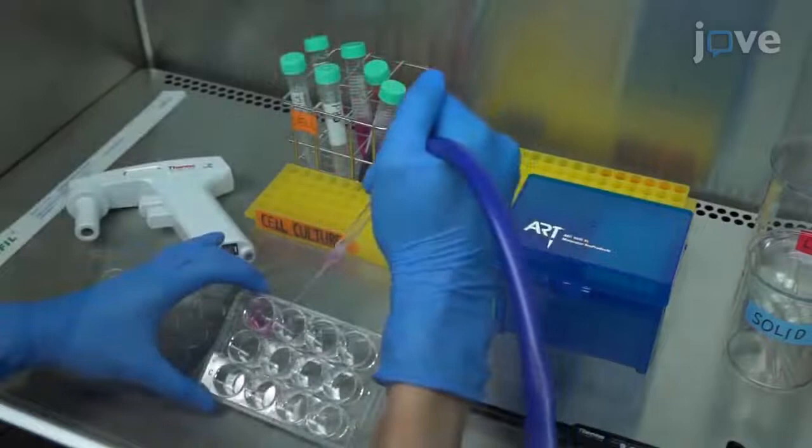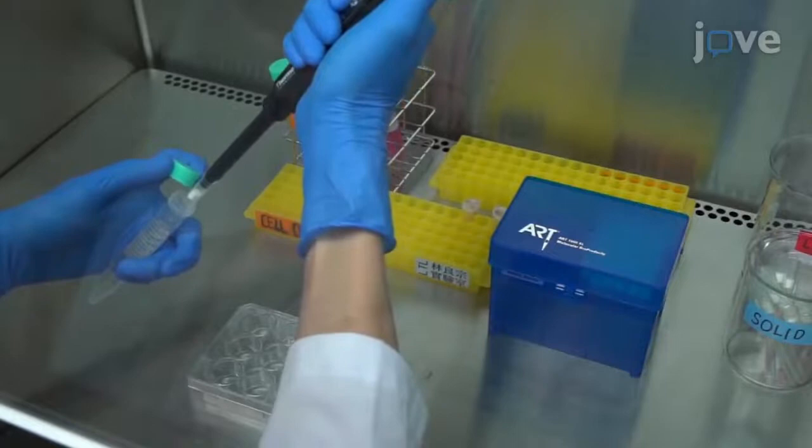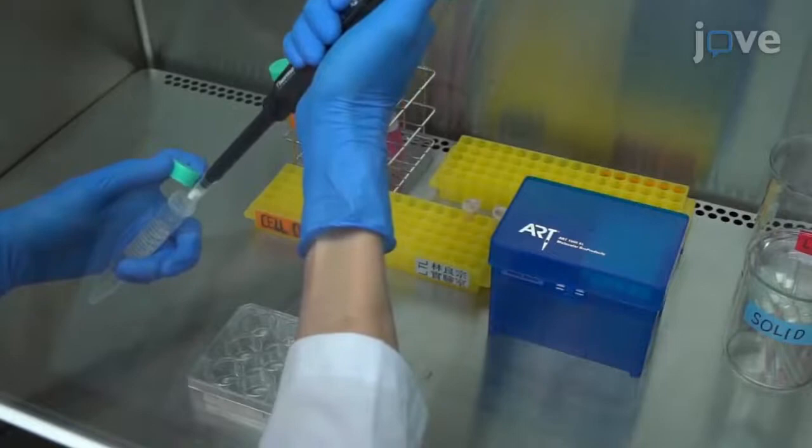After 72 hours in the cell culture incubator, wash each well with 2 mL of PBS and fix the cells with 0.5 mL of 3.7% formaldehyde per well for 15 minutes.